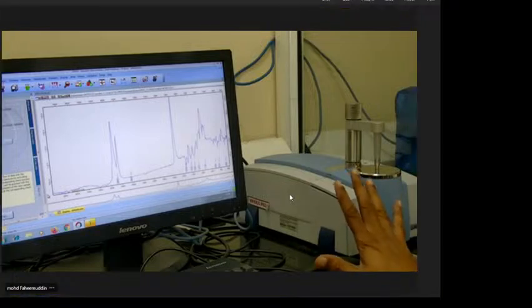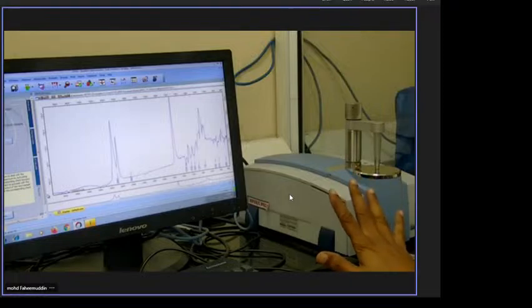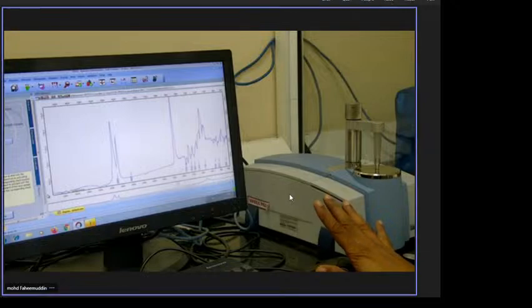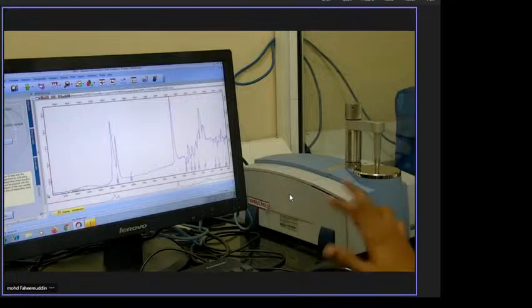So like this, any pharma industry, any QC and QA usually requires gas chromatography, HPLC, FTIR, UV, and other small instruments in the manufacturing sector. If it goes to R&D, we require advanced instruments like LCMS, GCMS, and so on. This is FTIR. Another technique is micro FTIR. The FTIR costs 12 lakhs. Micro FTIR costs 2 crores.